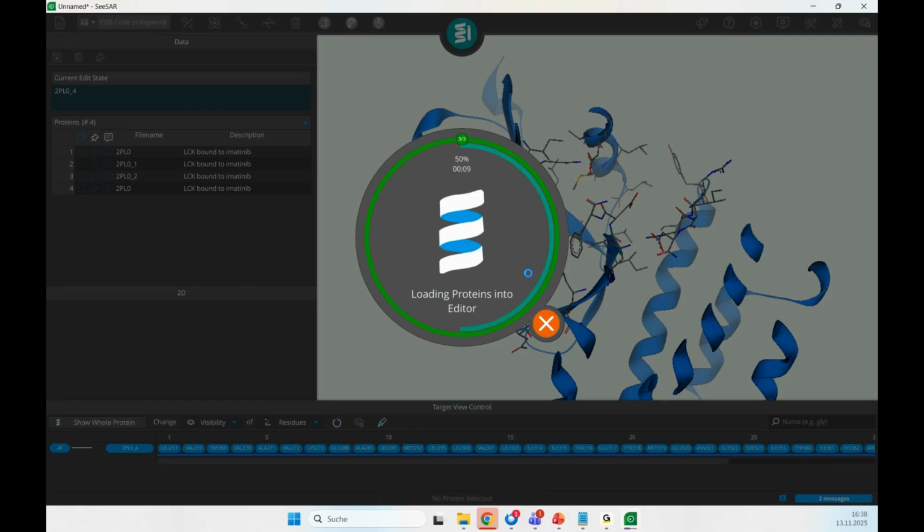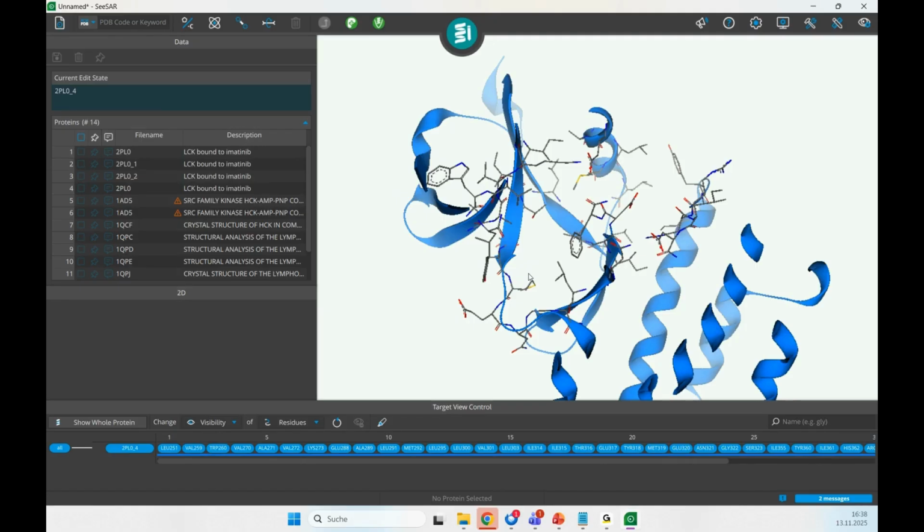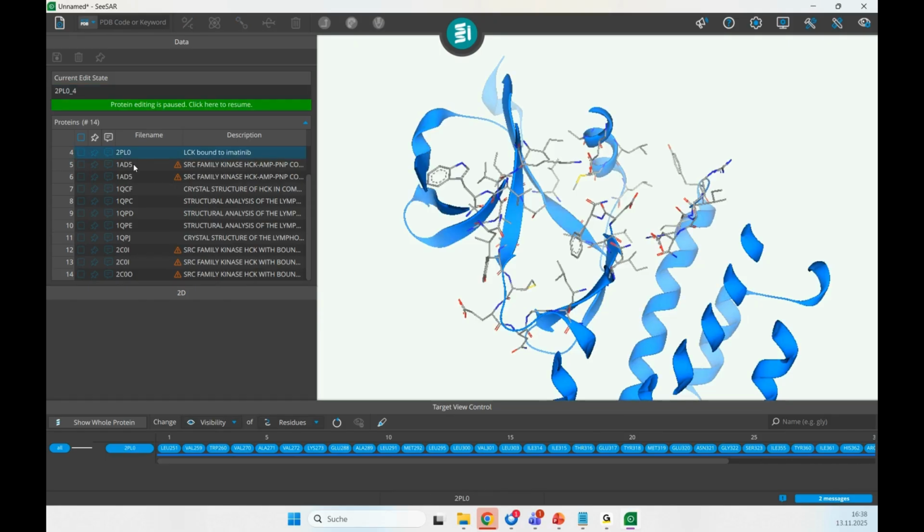We are not looking at the sequence similarity here, which you would do in every normal search. We are looking at the topology of the binding site, ultimately which compounds have a very similar binding site. This includes conformational changes, this includes active inactive states. So ultimately, this is a safer bet if you're looking for very similar binding sites. So we can see here the new structures that we have mined from the Protein Plus server that have the similar binding sites.